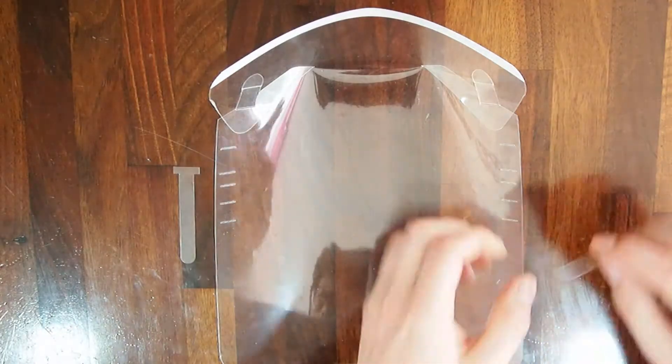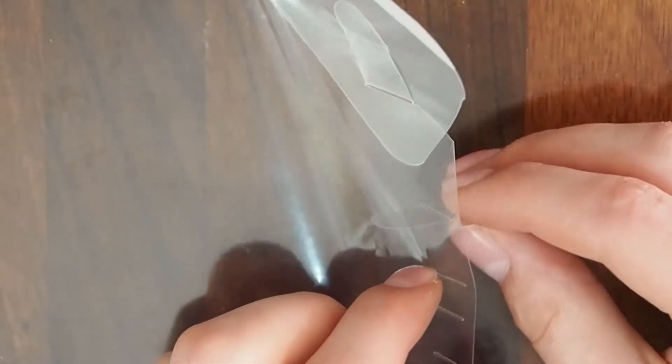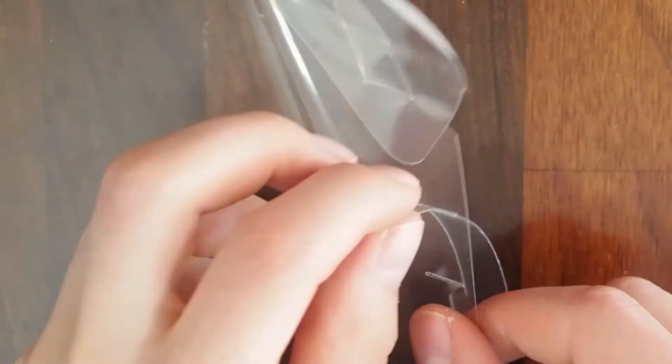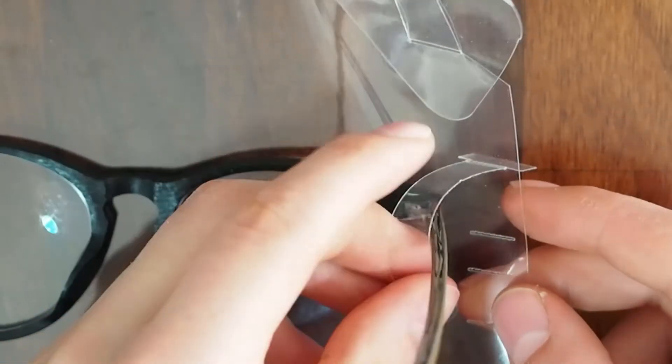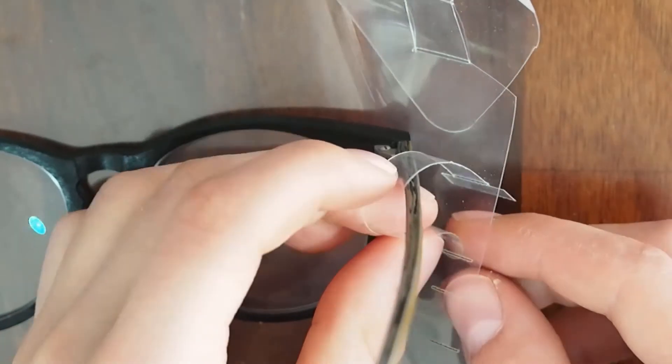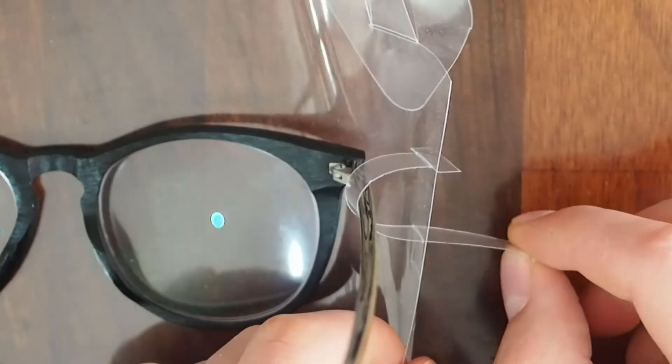Then, take one of the tags removed earlier and feed it from the outside in through the top slot. Take your glasses and lay them on top of the shield and wrap the tag around the arm of your glasses, and feed it through the next slot down.